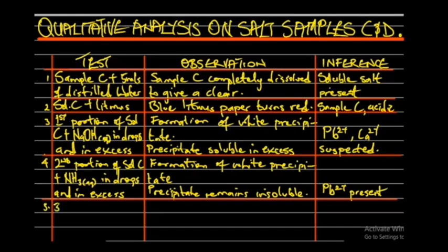To the third portion of solution C, we added dilute HCl plus heat. After we added HCl, we also decided to heat it.